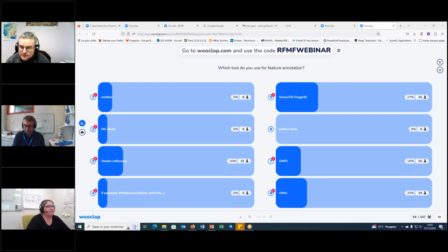Part of the community now has access to EI-HRMS data, and so MSP files are available. I think of one from the Řezetox lab in Czech Republic that released something on Zenodo recently, and we still have the NIST database that contains some tools.